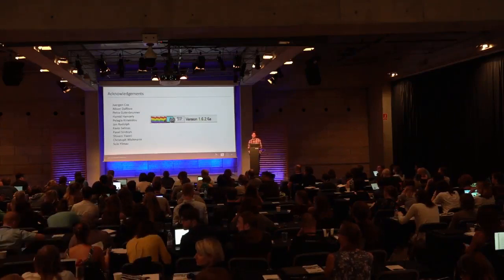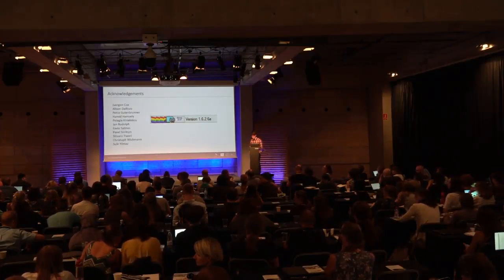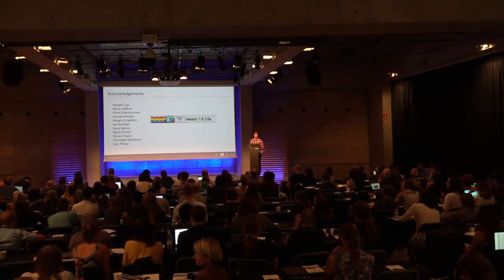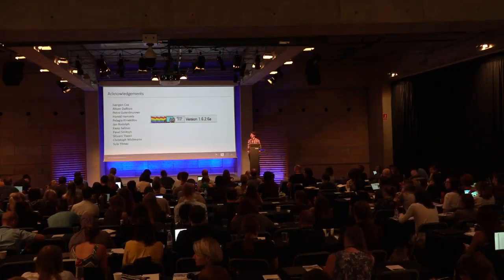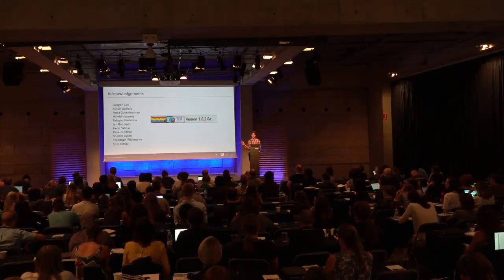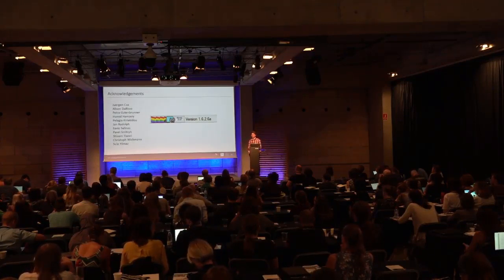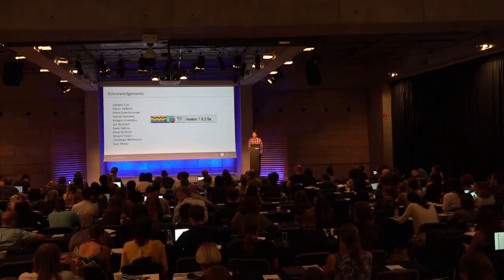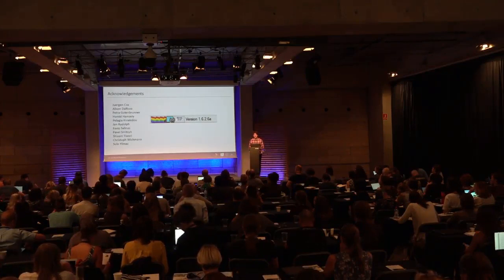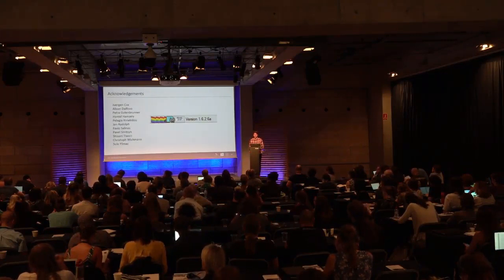Hi, thanks for the talk. I have a question regarding the occupancies working with TMT data, for instance, because you can imagine that the ratio compression will be very different in a deep proteome versus the phospho-enriched sample. How robust would you say MaxQuant is there? MaxQuant doesn't do occupancy calculations for TMT, but this benchmarking paper from Jesper that was just published has a strategy for deriving occupancies from phospho-TMT data. That's not implemented in MaxQuant, and I don't know if it will be, but you could use that to derive your own occupancies in some other software. Thanks.